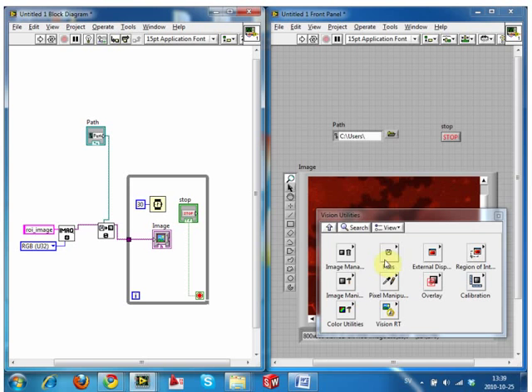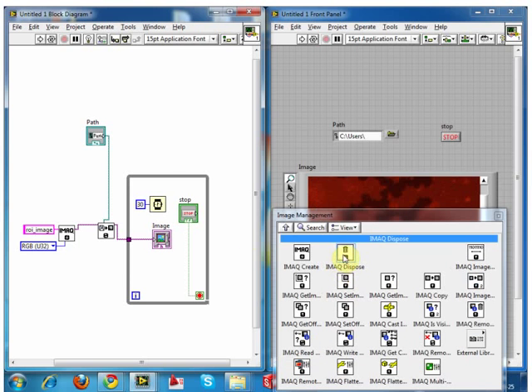So image management, put your garbage thing on the screen. There are two options that we can do. We can just wire up this error to this loop and find something to stick it to. We need things to run in sequence, I should say. We have to run this trash can after we've displayed the image. Okay, so we can wire this error to here.